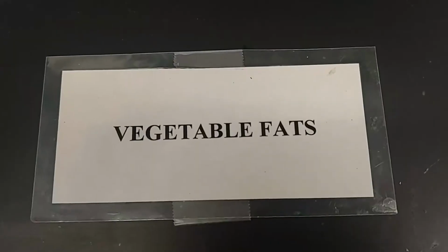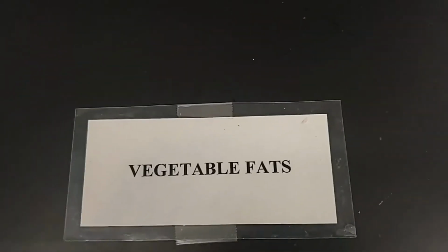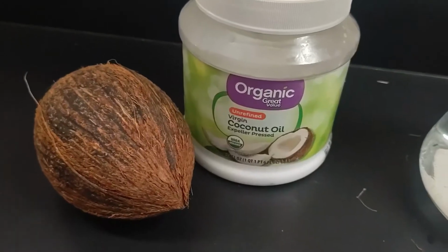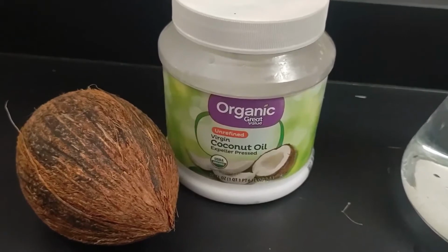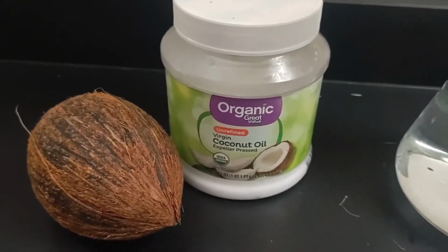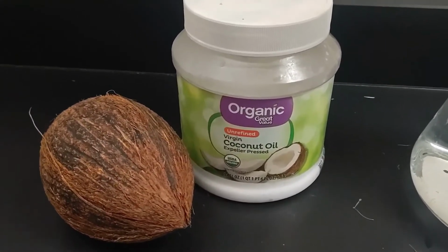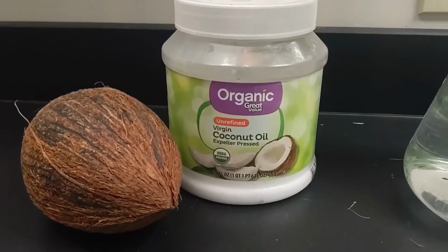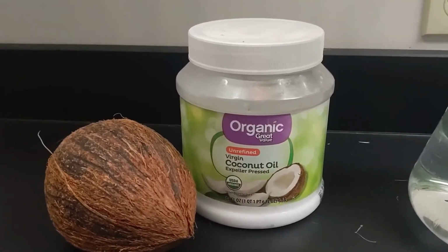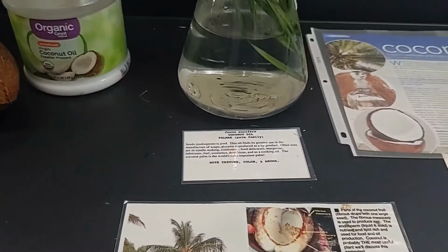Nice. Let's take a look at vegetable fats. Well, fats from vegetables, so let's see what we have. The wonderful coconut oil, which if you've ever used coconut oil or seen it in the store, it's in a kind of solid-ish form. It's not oil and it's not hard. It's kind of in the middle, these vegetable fats.